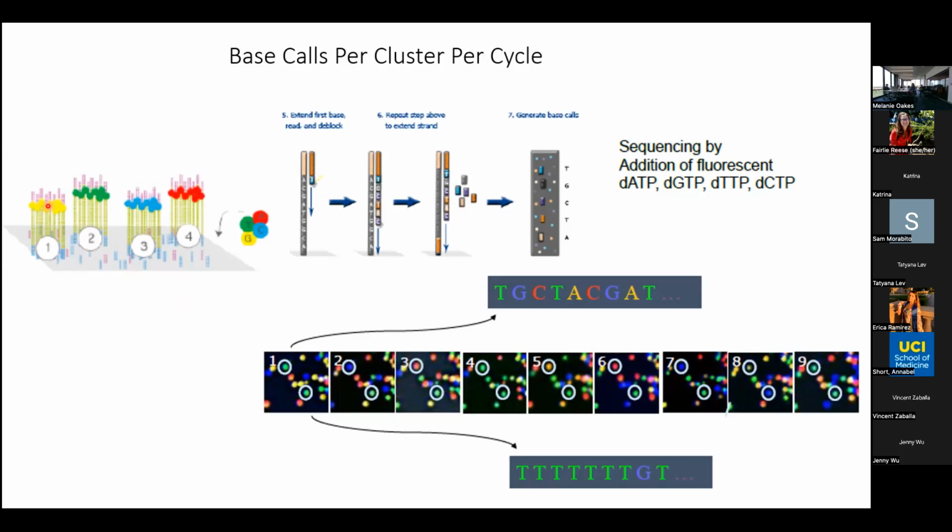So ideally, if you were thinking about improving technology, you would want to do it so that it would maybe be more sensitive than having to amplify this much, okay? So for this particular cluster, it was adding a G. This particular cluster, and again, this is from a single template to begin with, all right? It added a T, a C, an A.